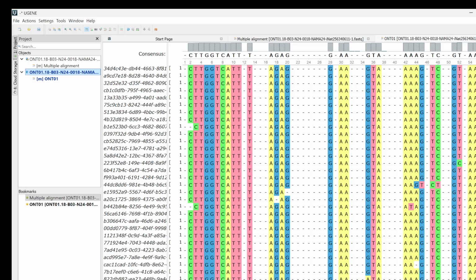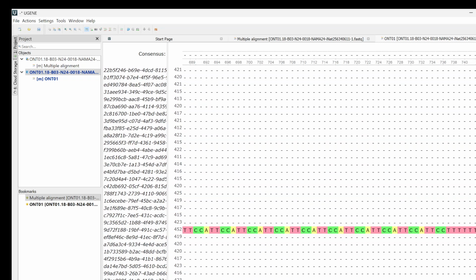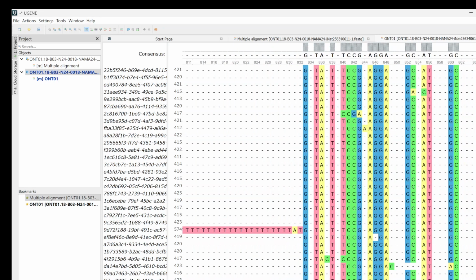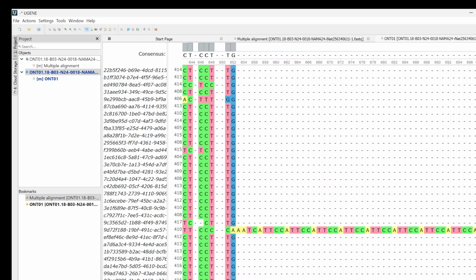So there's some funkiness going on with this. So what is this? There's one weird insertion of repeats. Oh my goodness. That's really weird. Really weird and unusual. It doesn't show up in your sequence on MycoMap.